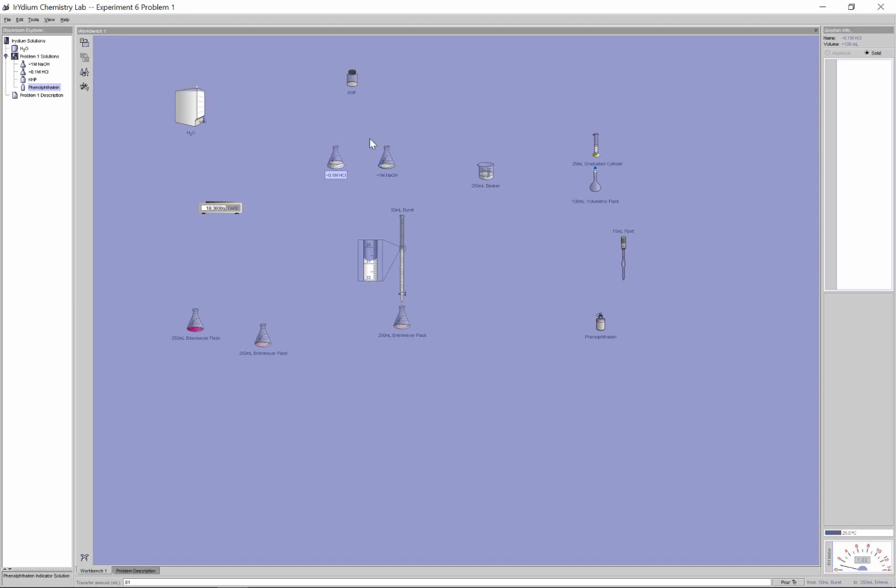I'm going to actually do this dilution. So what I can do here, again, the most accurate piece of glassware here is a volumetric flask to do the dilution in. I'm going to dilute it into a 100 ml volumetric flask. It could be the rinsed out one from before, or just take a brand new one here. Again, unfortunately, the volumetric only has the single mark for 100. I can't pour in, let's say, 8 mils, 10 mils, or whatever. I wouldn't know how to measure that.